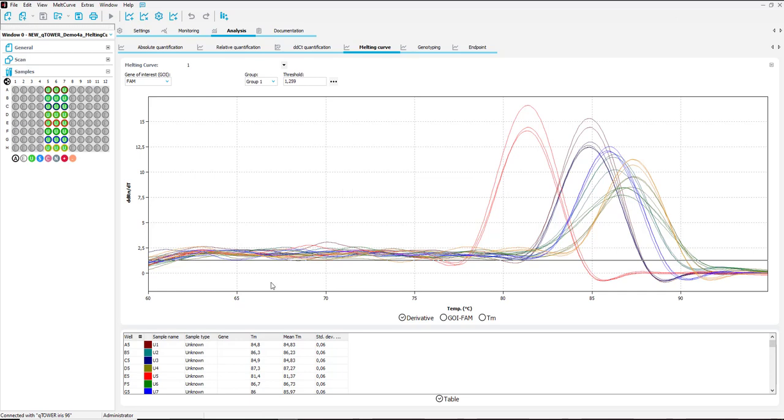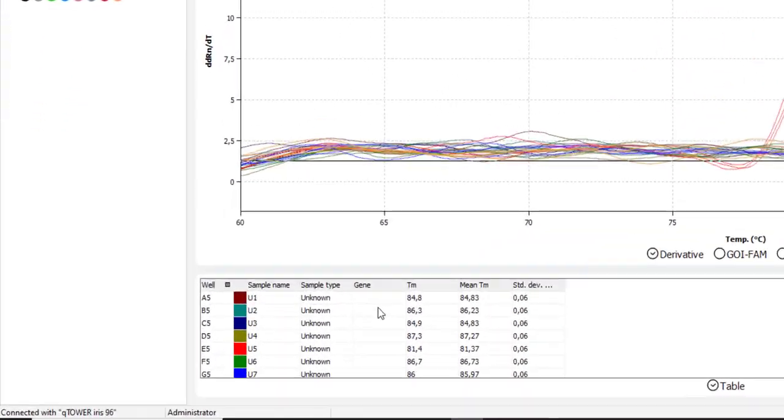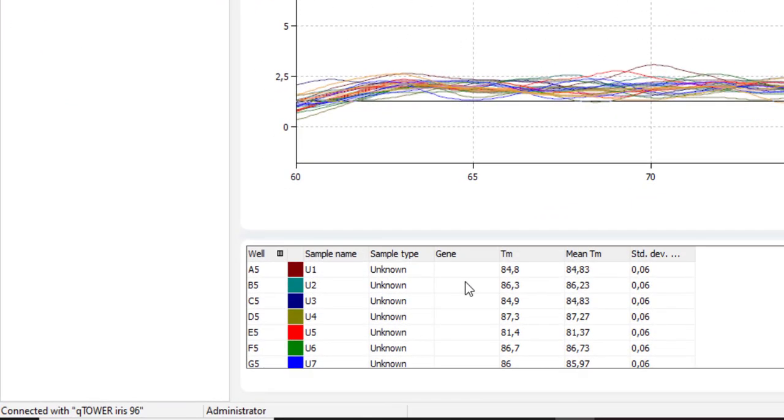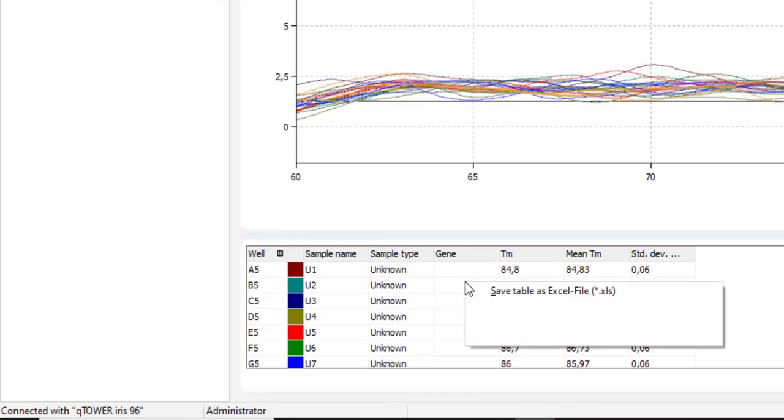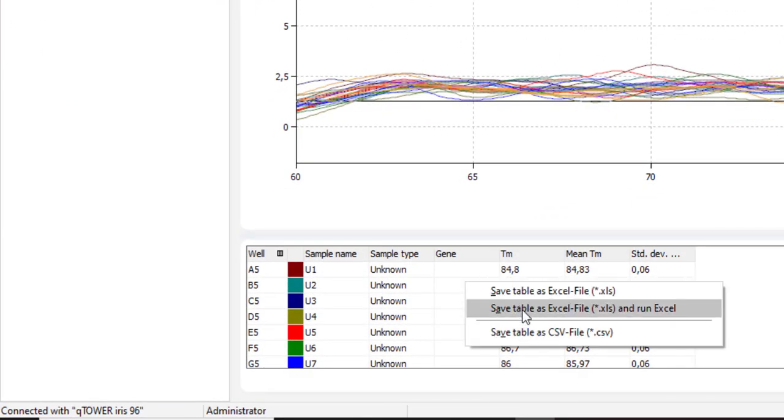The results of the table can be exported to Excel via right click on the table and select saving of .xls or CSV file.